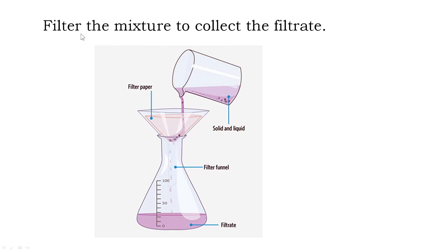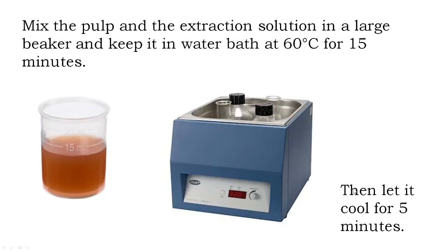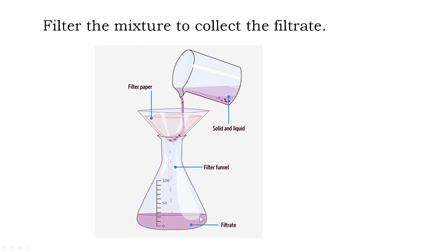After cooling, you filter the mixture to collect the filtrate. So you filter the mixture of the pulp and the extraction solution which you have mixed and kept in the water bath for 15 minutes, then cooled, and filter it to obtain the filtrate.